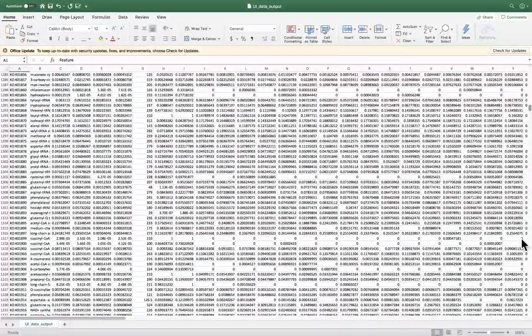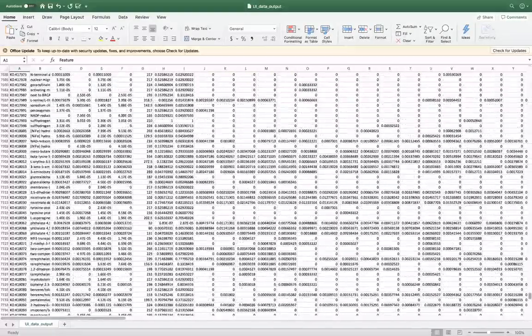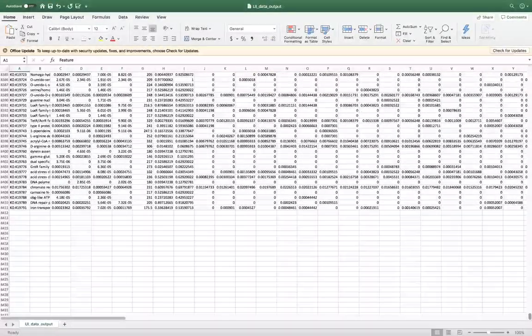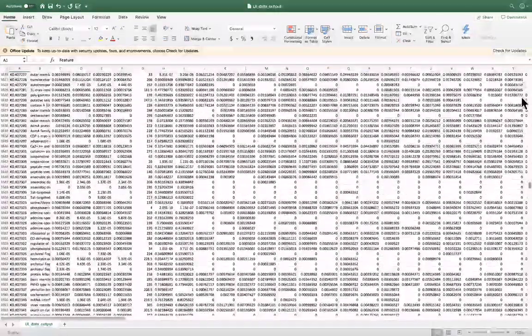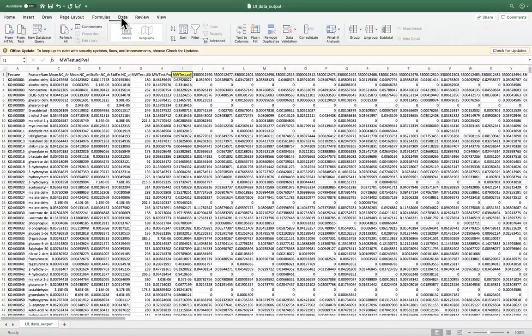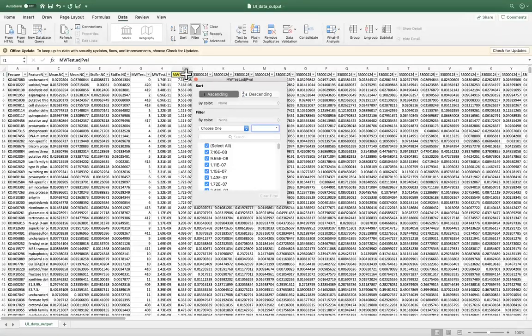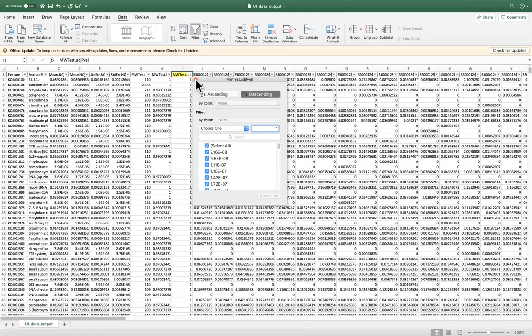I think I selected all non-zeros, so I have 8,410 KO terms now displayed. And then here is the adjusted p-value, right? So you can see the ascending and the descending. You see the non-significant hits are here.